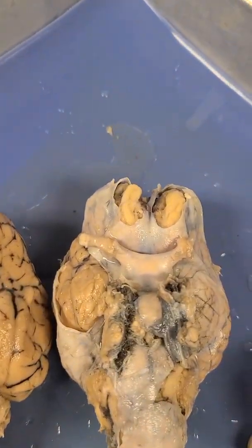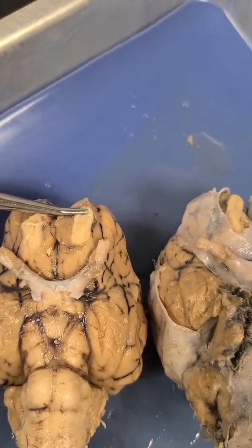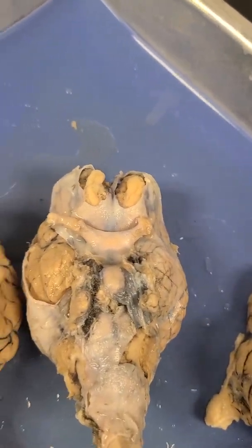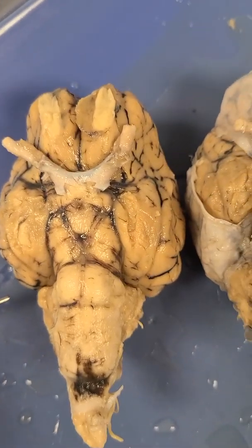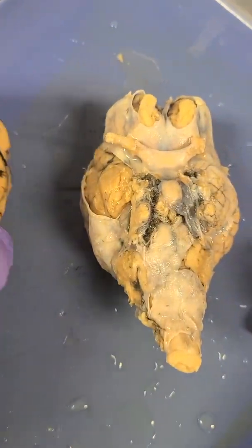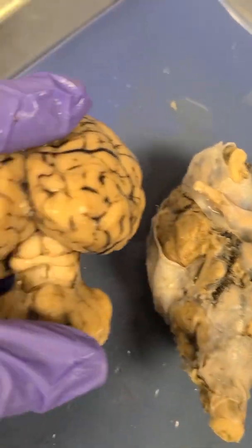The olfactory bulbs are cranial nerve 1, and these are the olfactory bulbs right here. These are fairly large in a sheep, and think about why sheep would need to be good smellers, or prey animals in general. The superior and inferior colliculi are reflex centers, visual and auditory reflex centers.